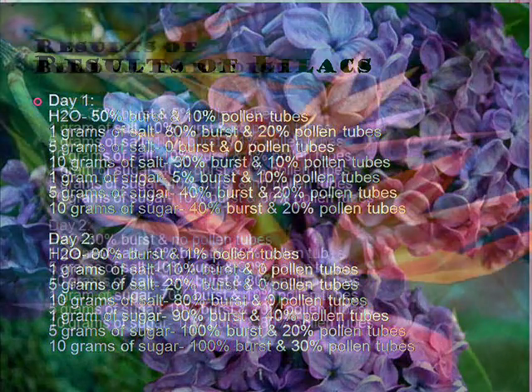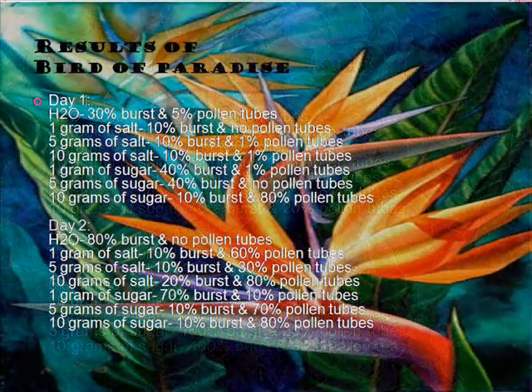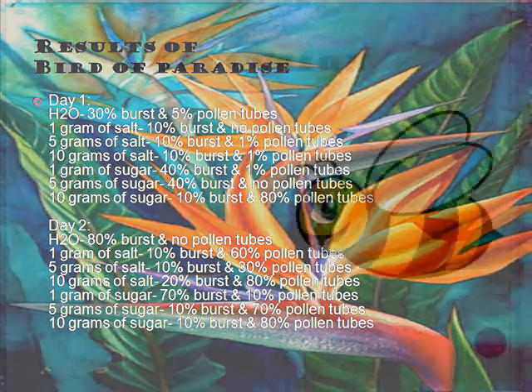The bird of paradise. The results for the bird of paradise were very satisfying. We had many pollen tubes and many bursting. It was very easy to get the pollen out of the bird of paradise, so this is why we believe that it has the best results.